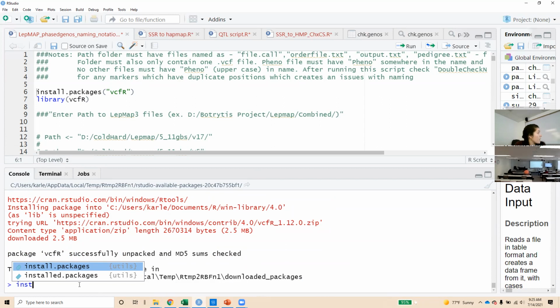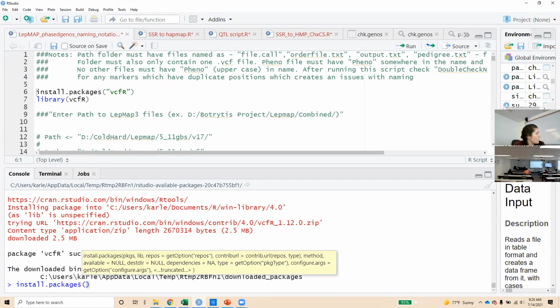I could have typed down on the bottom in the corner, I could have typed install and the same thing, and just hit enter a single time, but that doesn't store the work that I've been doing. If I put it up here, I can save all of this text to run at a later time.